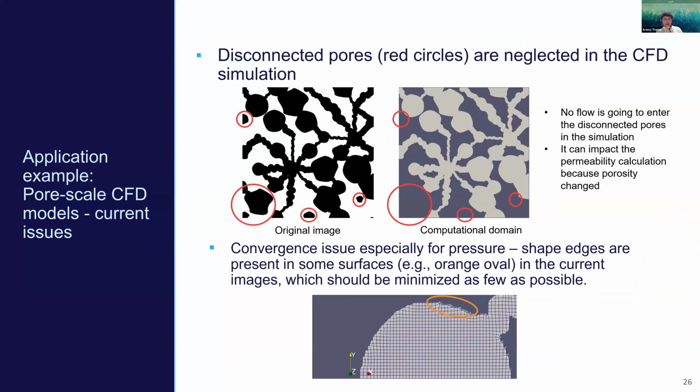And for the meshing, that will be tricky. But we can work on that. The one thing is to have a very smooth surface of these pores, then a high resolution of the image imported into this solver should be able to solve this issue. I'm pretty sure that could be solved since we export an SVG image. It'll be a very high resolution picture though.